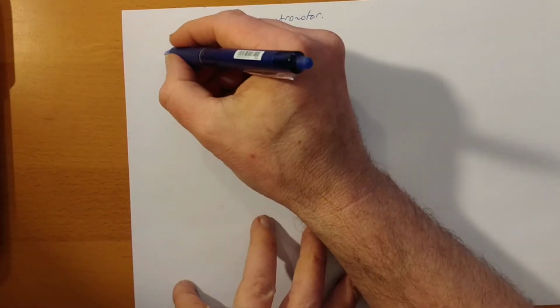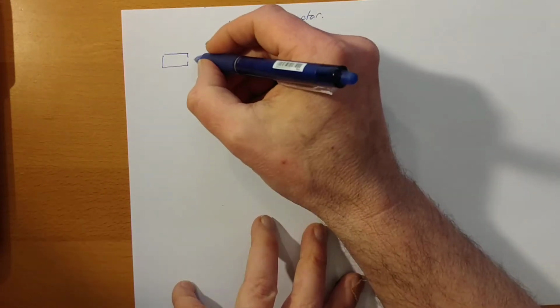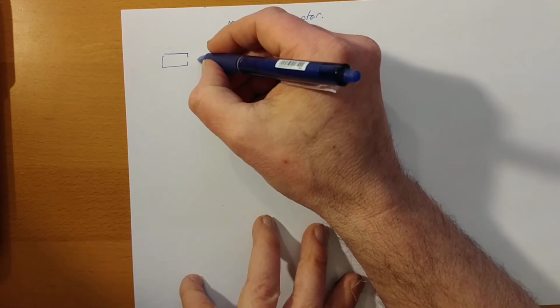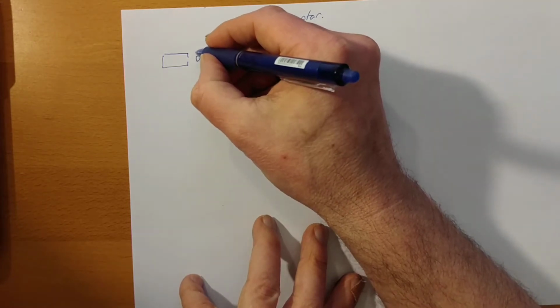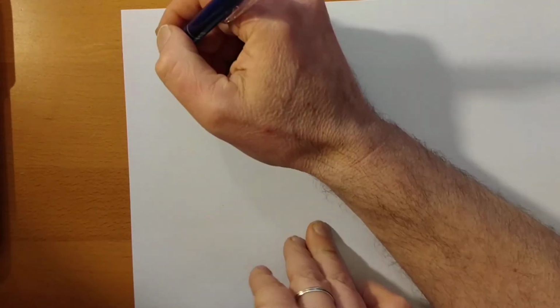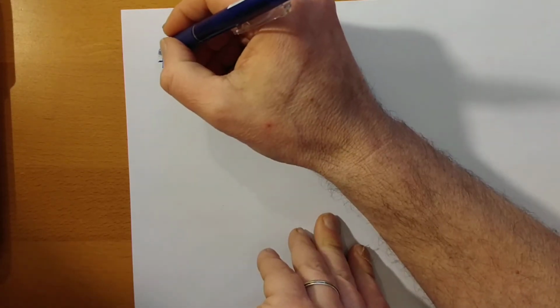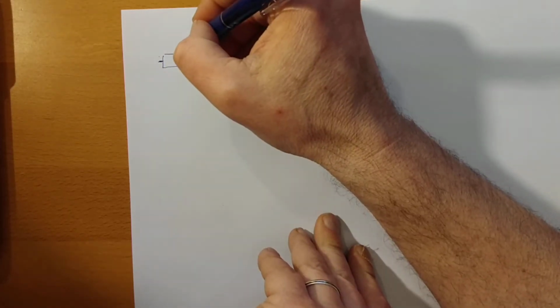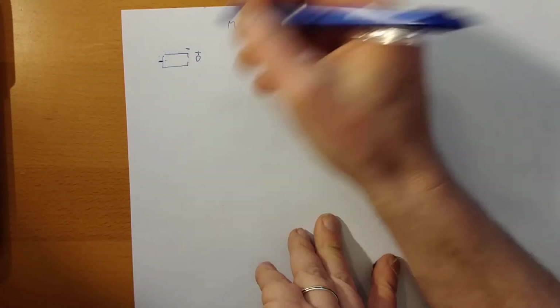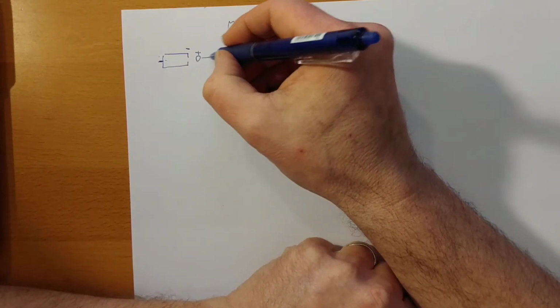So the first thing we need is some kind of source where you can throw out the molecules or the atoms, and we see to it that we strip away one of the electrons on the way out. We do that over here. We strip it away, and then we see to it that this end is negative, so they will be accelerated through here. So we throw out particles here. They will have different velocities and so on, but they will move in that direction.